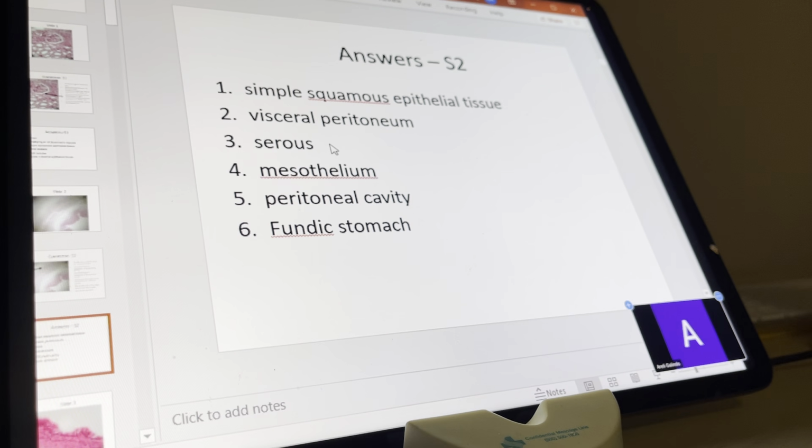You're totally right, but I want you to just finish it. Keratinized, simple stratified? Well, it's either simple or stratified. Oh, okay. So it's keratinized, stratified squamous epithelial tissue. Yes, exactly. Keratinized, stratified squamous. Perfect.